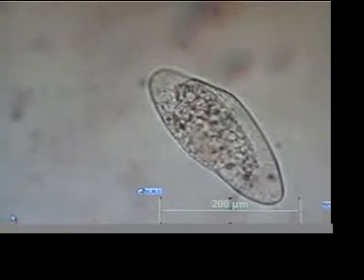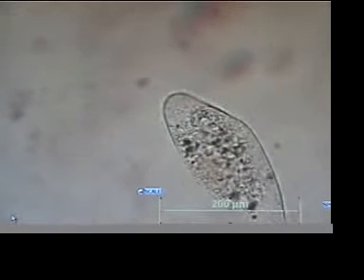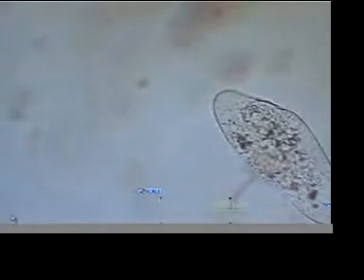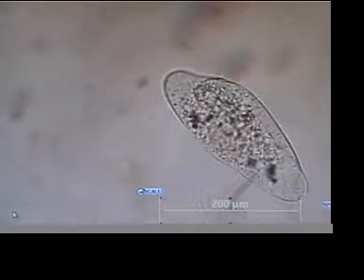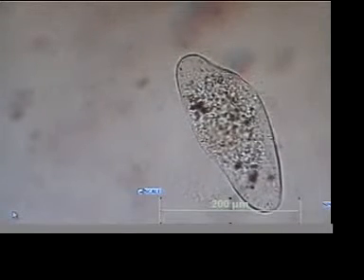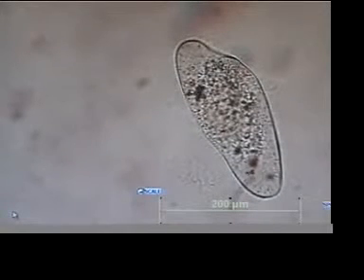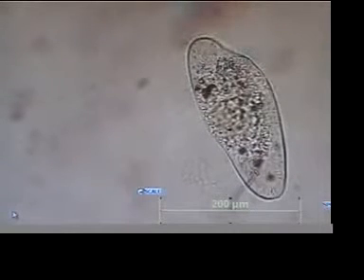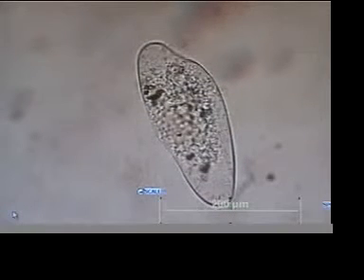This is live devitalization of a paramecium. You can see it's already changed in shape quite a bit. Give the computer a little more light to work with. This is under the 40x objective. Try to center it on the screen.